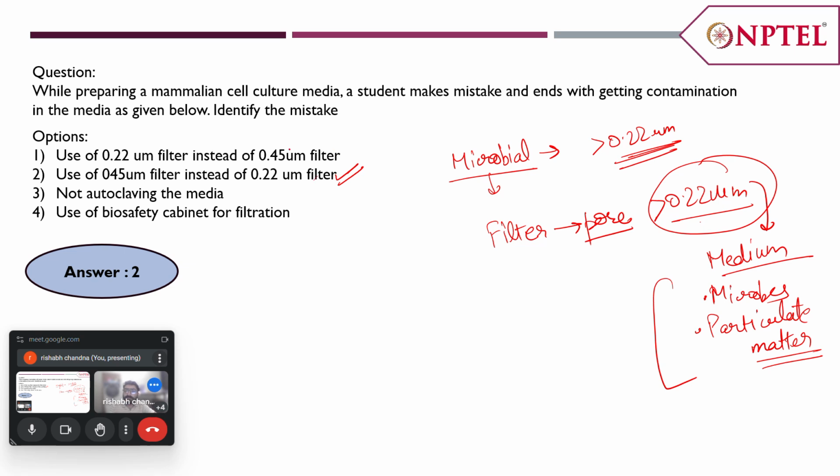And if we are using a 0.45 micrometer filter, then the bacterial cells can enter into the media and cause contamination. Okay, so any doubts in this particular question?